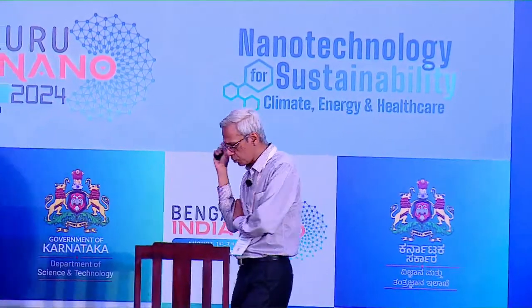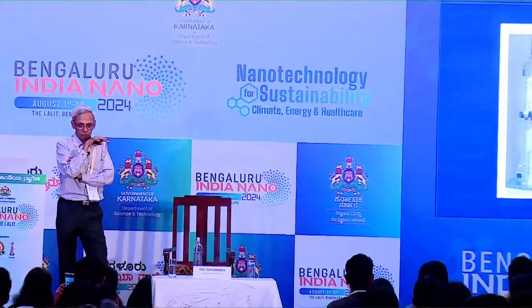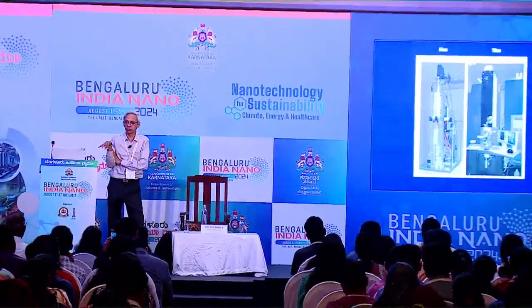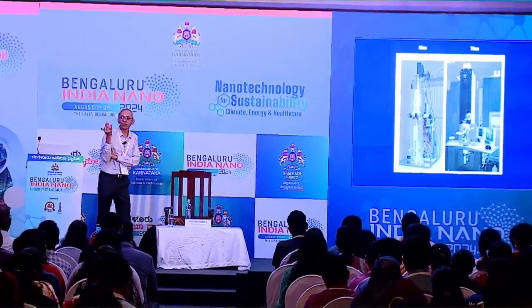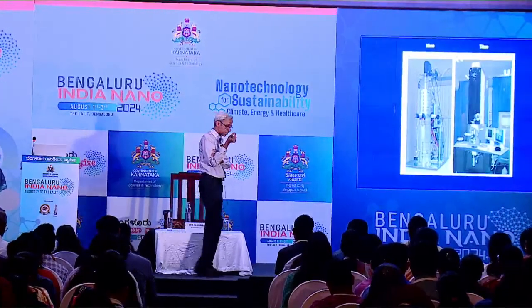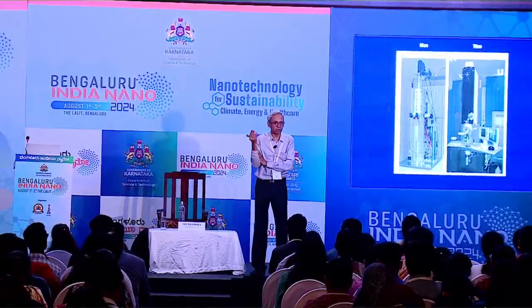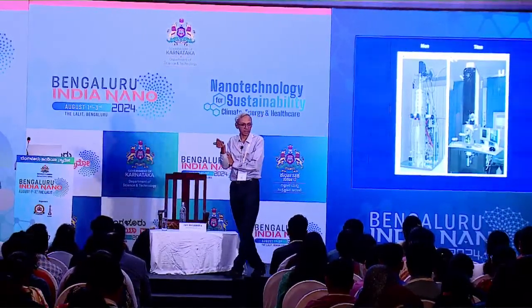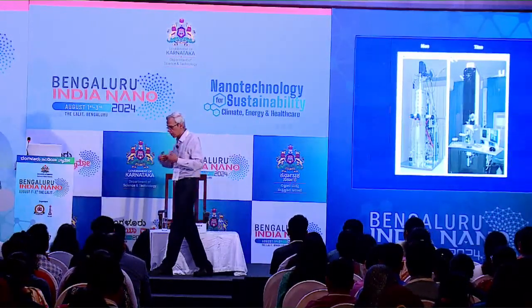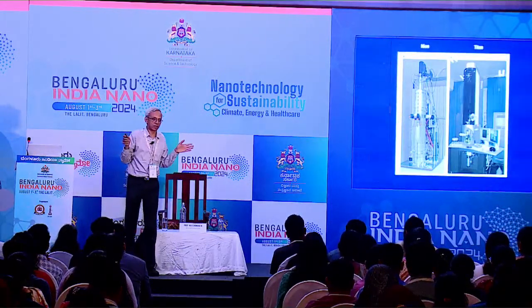The way I'm going to do this talk is not to go into the physics and details of how the electron microscope works, but rather to show you examples of the information we get from nanostructures, and in showing these examples, I'll briefly explain how you get those and what analysis we can do. Because if I start going into the basics, it's going to take a very long time, and I teach this course for a whole semester.